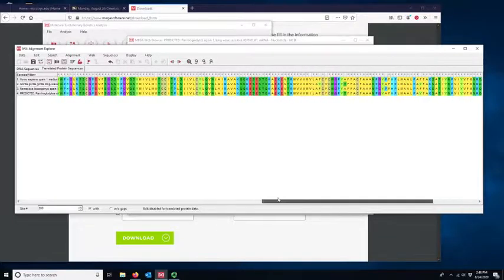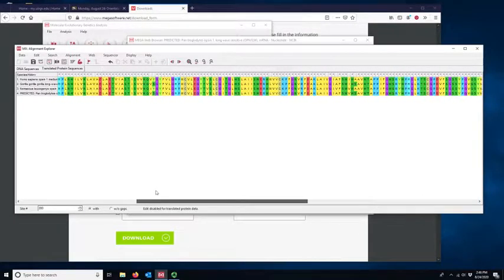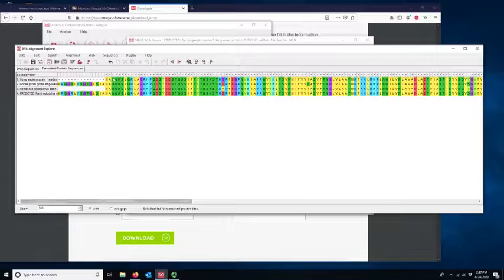So now notice at the protein view, we have quite a bit of sequence conservation. There are differences here and there, right? So we have some differences. And then there's a little difference in length. So the gorilla and the chimpanzee have a longer sequence. It looks like there has been a deletion in one or more of these lineages. And we'd have to look at a phylogeny and map them on, which is stuff for later in the semester.